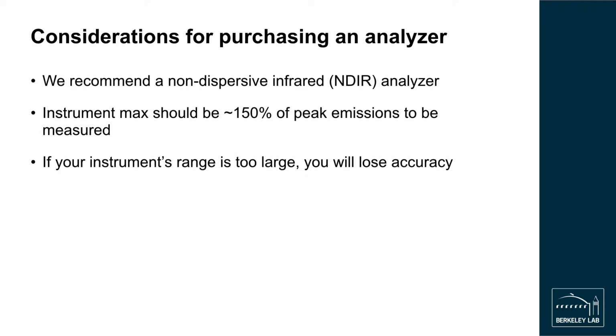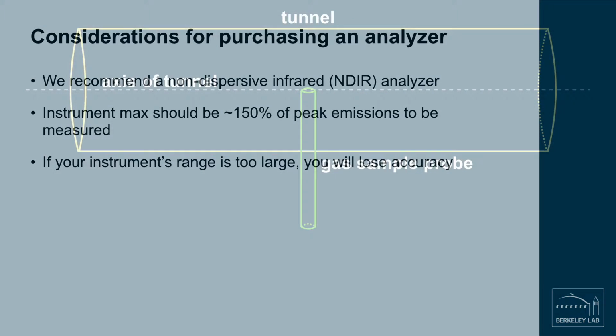However, it is important not to dramatically overestimate the pollutant concentrations because as the range of the gas analyzer increases, its accuracy at lower concentrations decreases.